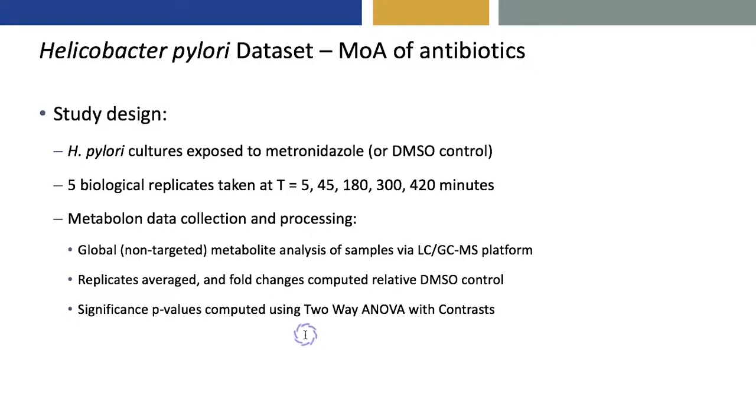And the overall study design is that 5 different biological replicates were taken at 5, 45, 180, 300, and 420 minutes after exposure to metronidazole began.